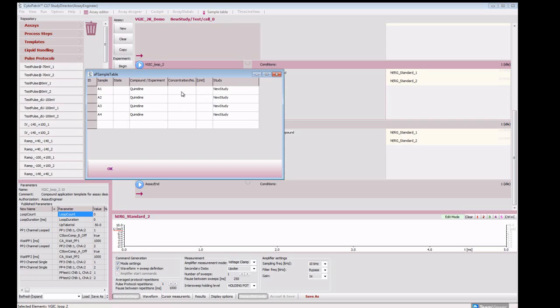So as we're doing a dose-dependent concentration experiment, then we want to go for 0.1, 0.2, let's say 0.5, and 1. So we don't write a unit along the same column. We have a column where you have the unit on top defined, so we can drag the unit alongside. So we just pull the unit out, which is micromolar, for each of the positions defined with the compounds in the compound rack.